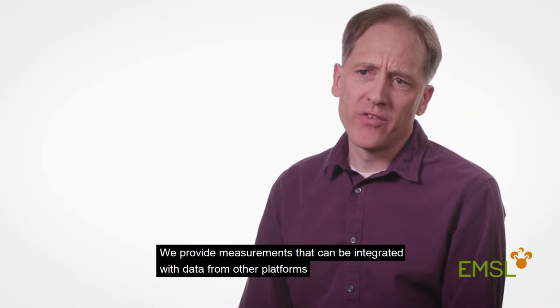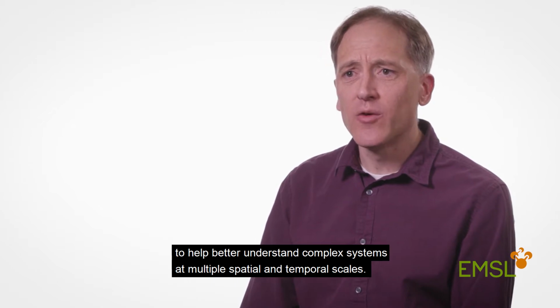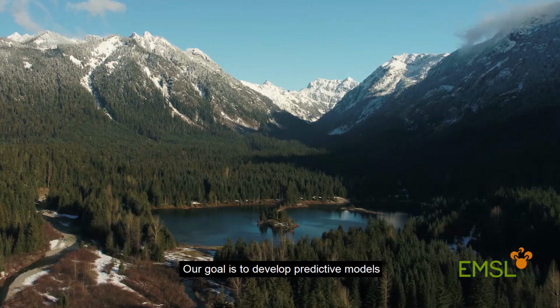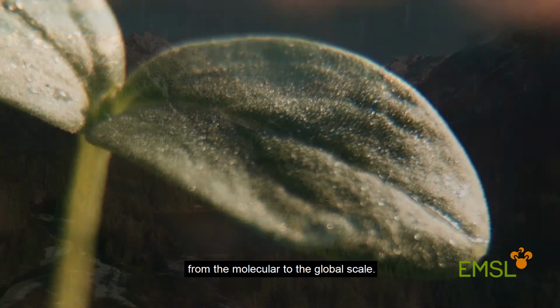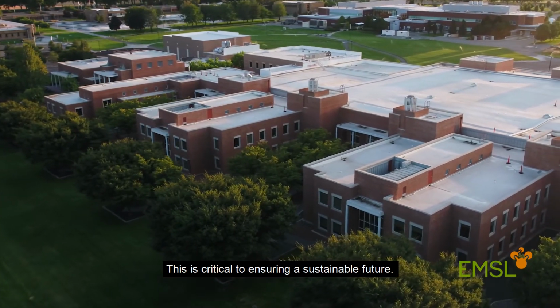We provide measurements that can be integrated with data from other platforms to help better understand complex systems at multiple spatial and temporal scales. Our goal is to develop predictive models which will help us better understand our planet from the molecular to the global scale. This is critical to ensuring a sustainable future.